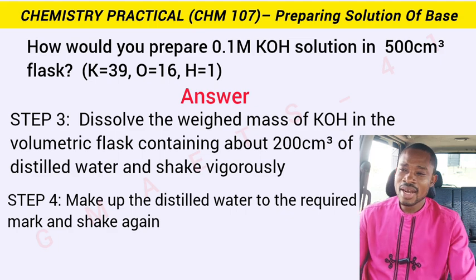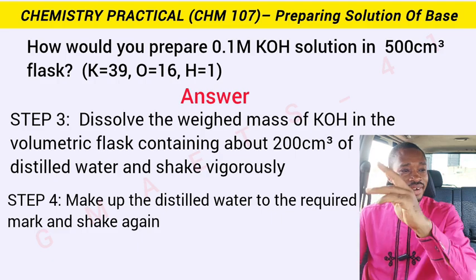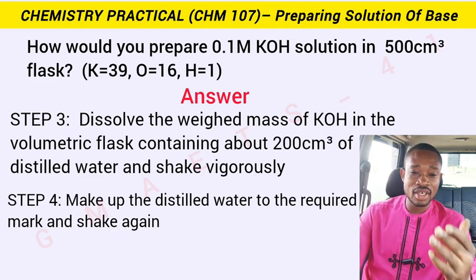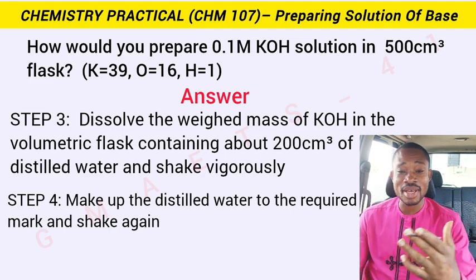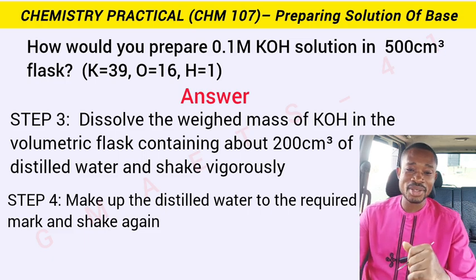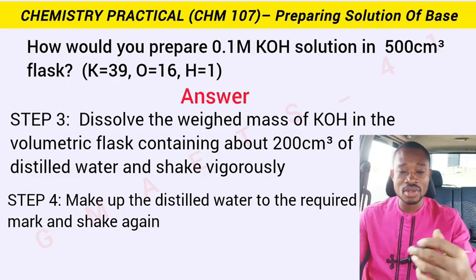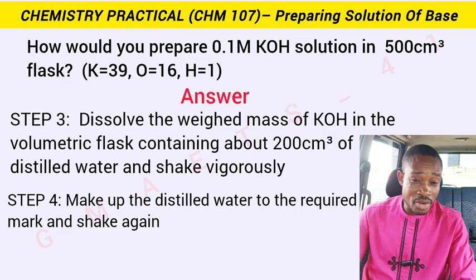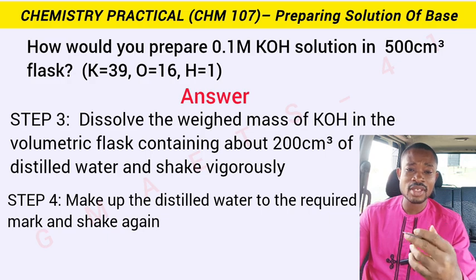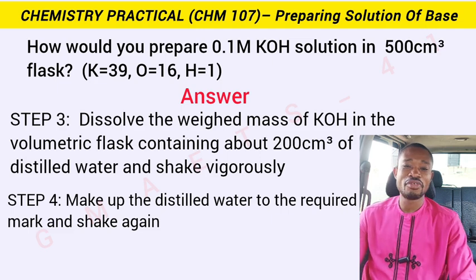Is that okay? And our dear chemistry teachers at O level, usually, like I said, you are given a hint, a white paper by our exam bodies, WAEC, NECO, and you are required to prepare a solution that your students will use for chemistry practical. Are you having challenges on how to prepare these solutions? You'll be given certain specifications as required by the exam body. This is the procedure you follow.